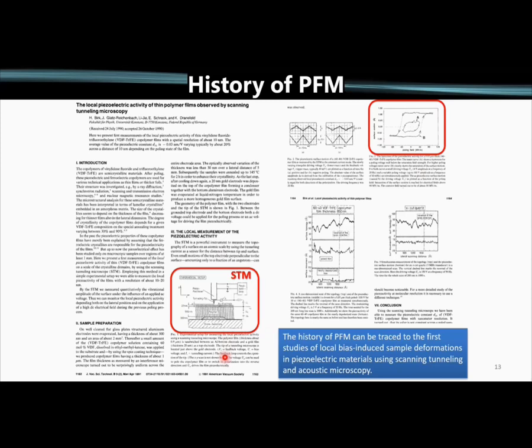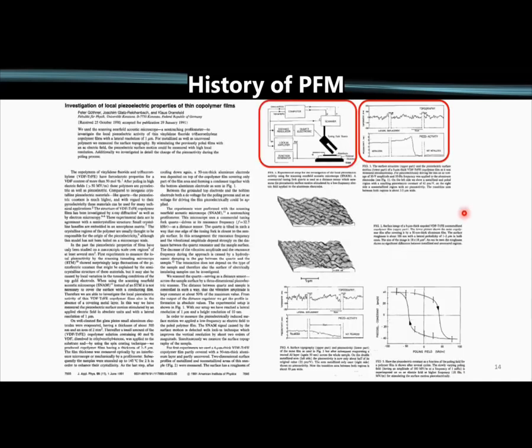The history of PFM can be traced to these first studies of local bias-induced sample deformations in piezoelectric materials using STM, but also using scanning acoustic microscopy. That's this paper here. Again, we're investigating the piezoelectric properties of PVDF. So the history of PFM is traced to ferroelectric polymers.